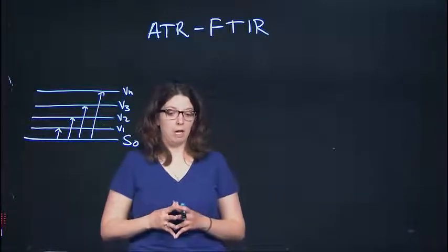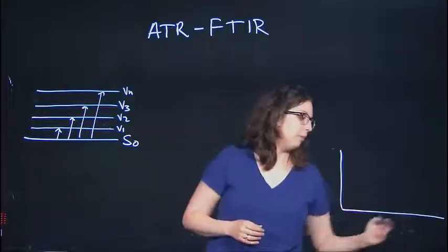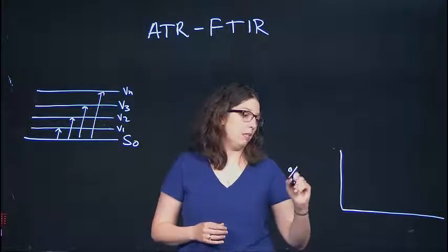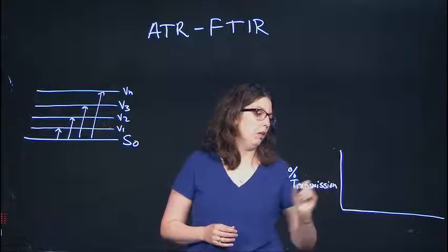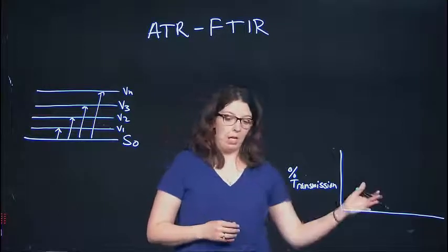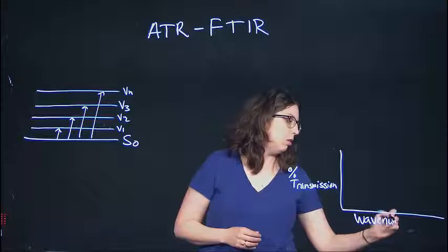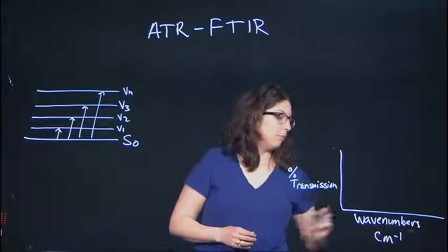Okay? When we measure our infrared spectrum, our y-axis is going to be typically in percent transmission. Okay, but it can also be in absorbance. Okay, it is an absorption. And our x-axis is going to be in wave numbers, which is given in inverse centimeters.